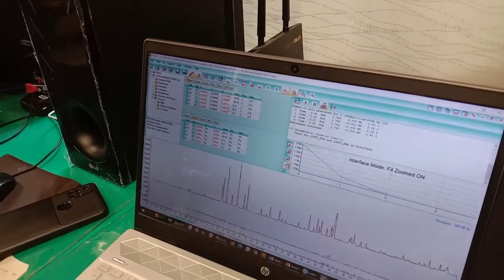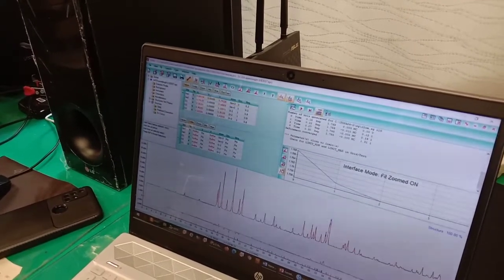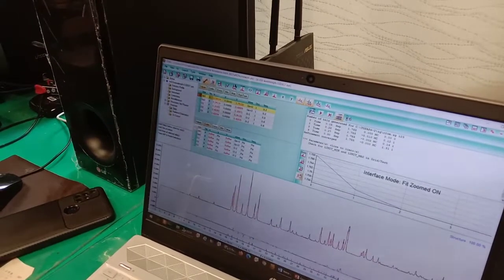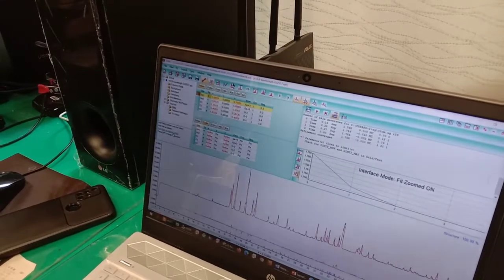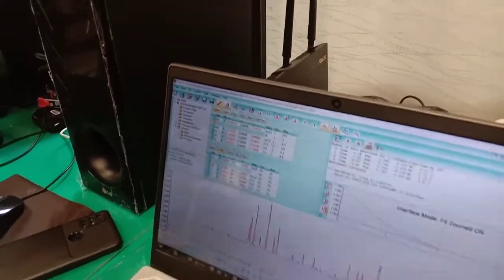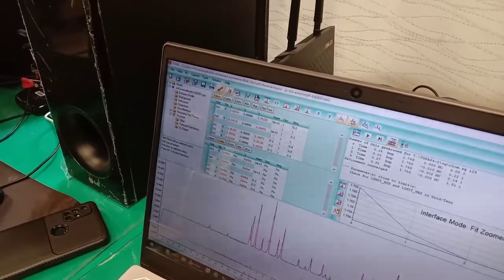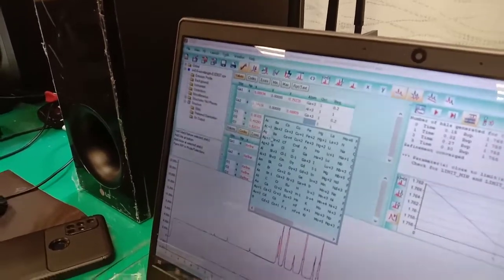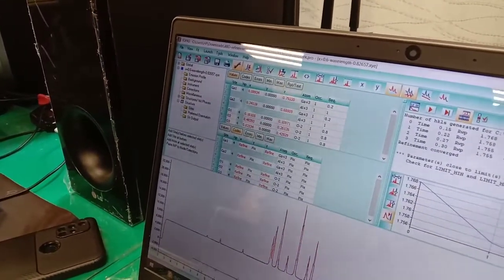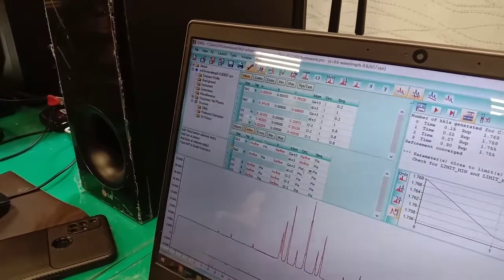Okay. So like he put aluminum in this case, right? So you have to put aluminum at a particular site. For that you have to choose this. You have to click it. It turns yellow, and you have to say add atom at a particular site, and it says aluminum plus 3. Similarly choose here. Then you have to choose here. It will have aluminum plus 3. Aluminum plus 3. Okay, so here you can just open it and you refine it.